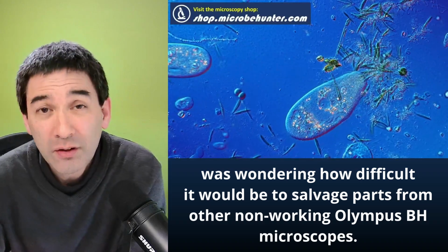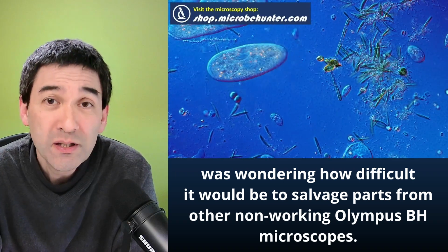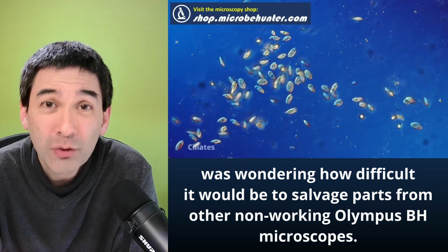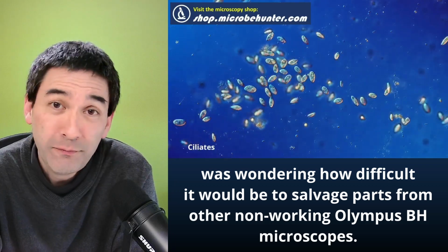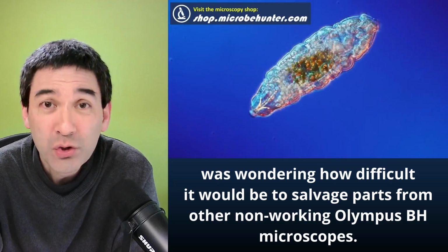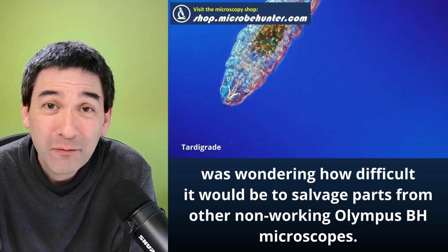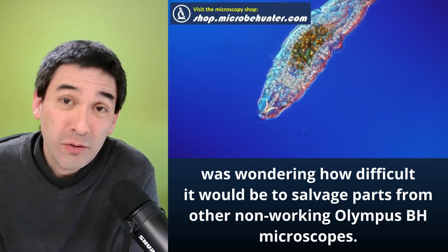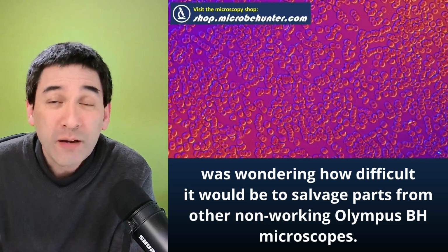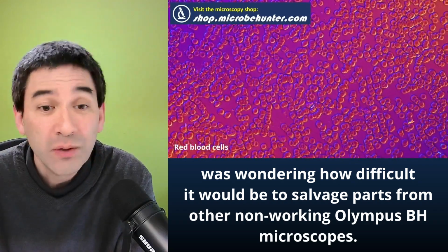Now, another thing I want to mention is that the BH2 microscope, just like many other traditional systems, had 160 millimeter optics. And yes, there are modern microscope optics available, fairly low cost, that you can fit on the BH2 microscope. The BH2 from Olympus was not an infinity microscope, and for this reason you can still obtain new objectives that would fit. So you do not have to rely in all cases on original parts, even though that is, of course, also a possibility.